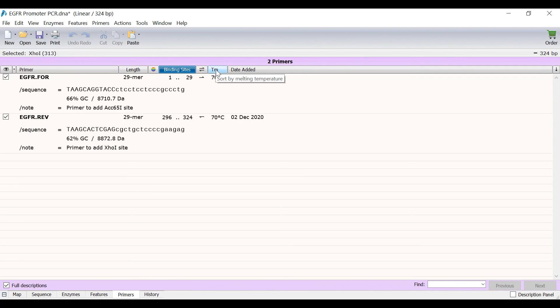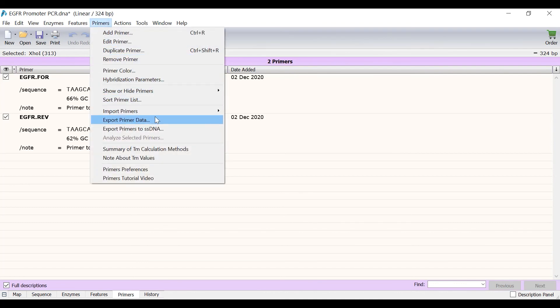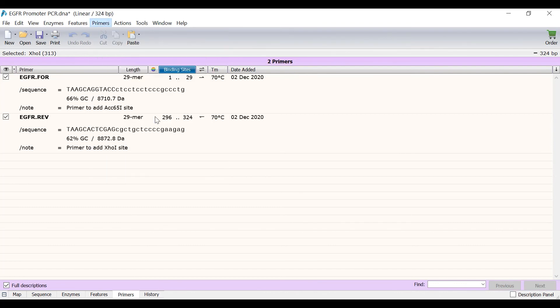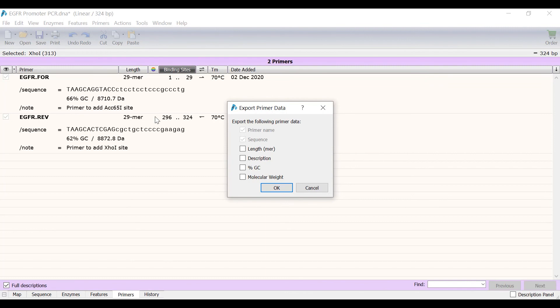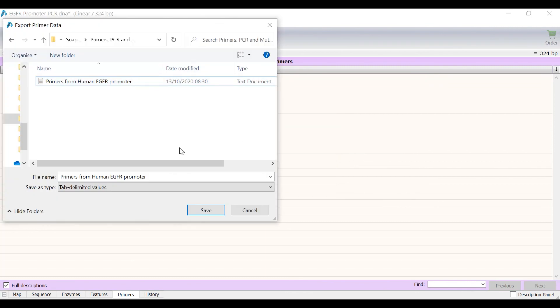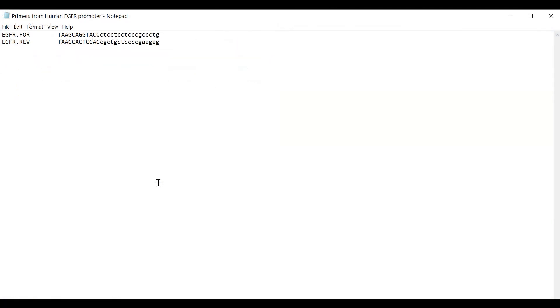If you want to proceed to order these primers you can export them as a text file by going to Primers, Export Primer Data. You can export additional information about the primers if you so wish. I will save the primers as a text file where you can see their name and sequence in a simple list, ready to be copied over to your primer order form from your supplier.